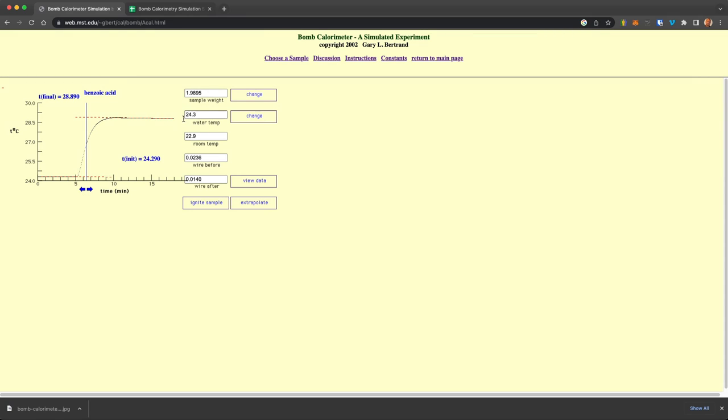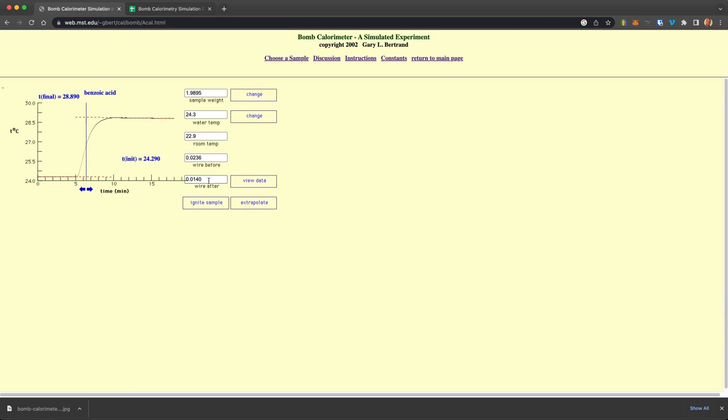Now, these were the initial parameters here. Now you'll see that this is the wire, the weight of the wire after you ignited the sample, meaning it didn't all combust and you'll need to take it into account for that. And the amount that did combust, what heat was given off from it.